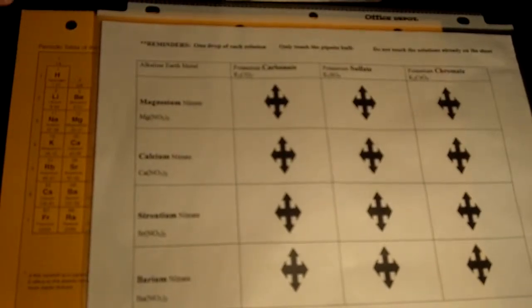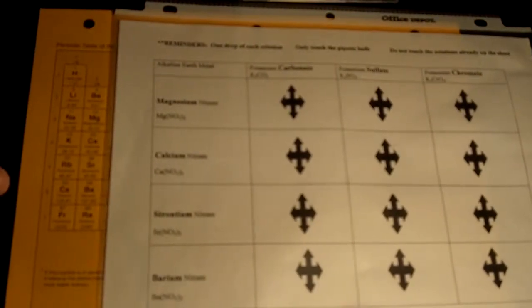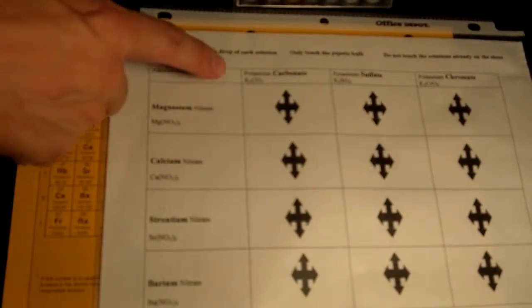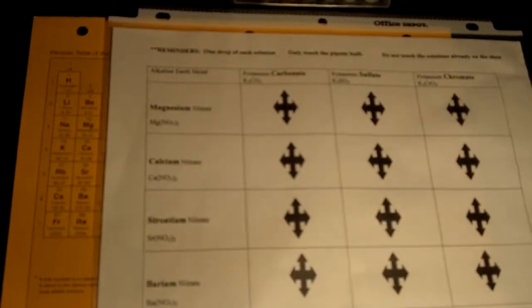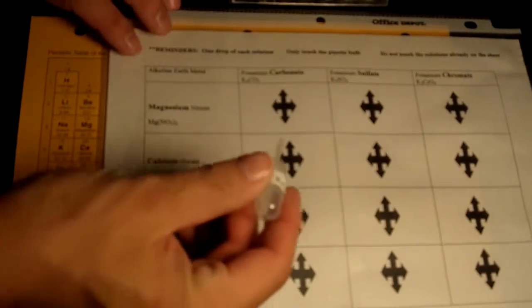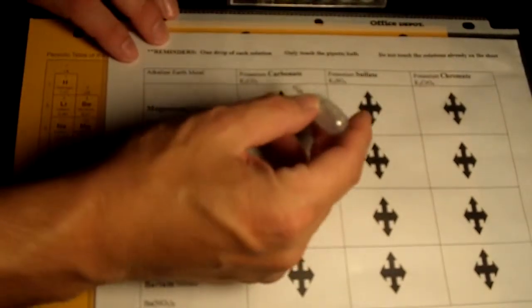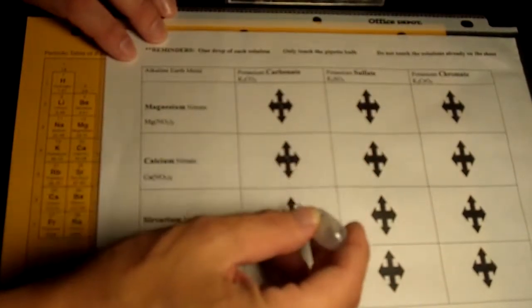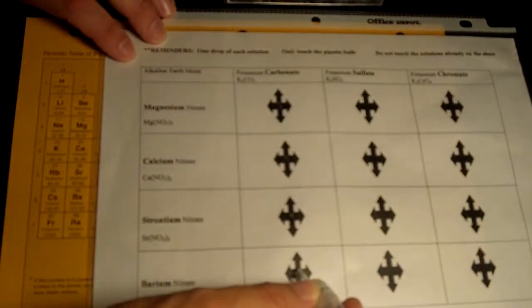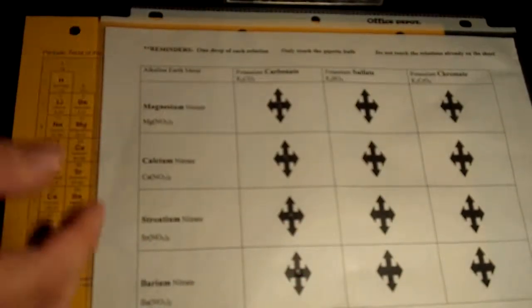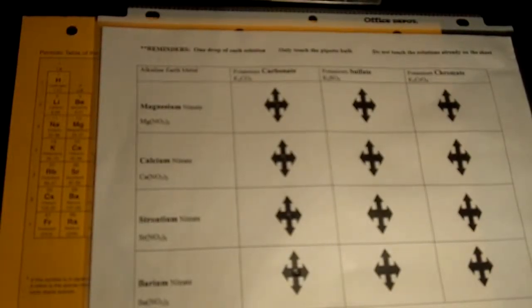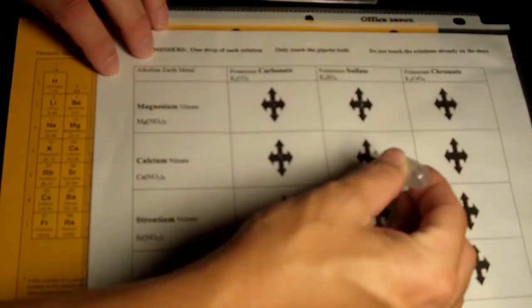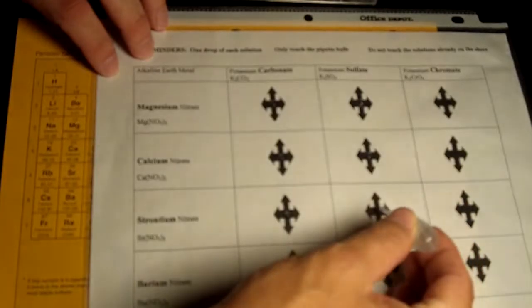So, once we do that, then we're going to cross-react it with the alkaline earth metals. Remember, these are all aqueous solutions. Aqueous means just that they've been dissolved in water. So, the first compound that we're going to use is the potassium carbonate. I'm going to get the potassium carbonate pipette, and then I'm going to hold the pipette right over the target, and I'm going to squeeze out just one drop. And then I'm going to move down the column and do the same to the remaining three targets. And then once that's done, then I'm done with potassium carbonate. Then I'm going to move on to the next one, which is the potassium sulfate, that's K2SO4, and I'm going to do the same thing. Again, just one drop on each one of these.